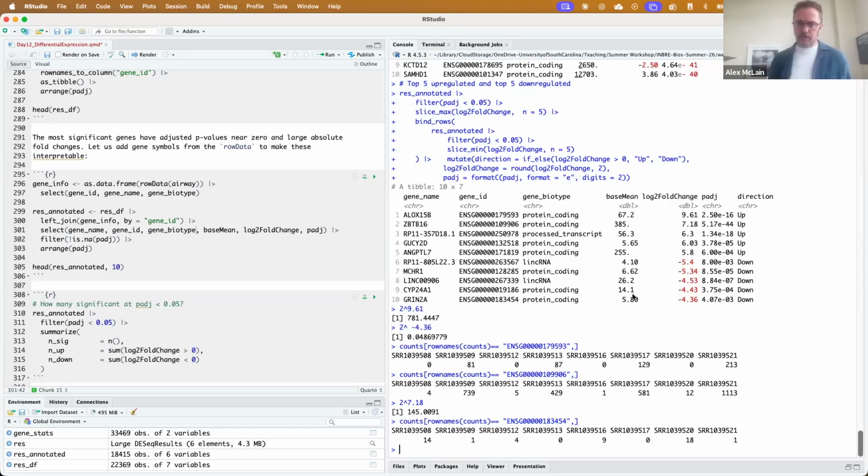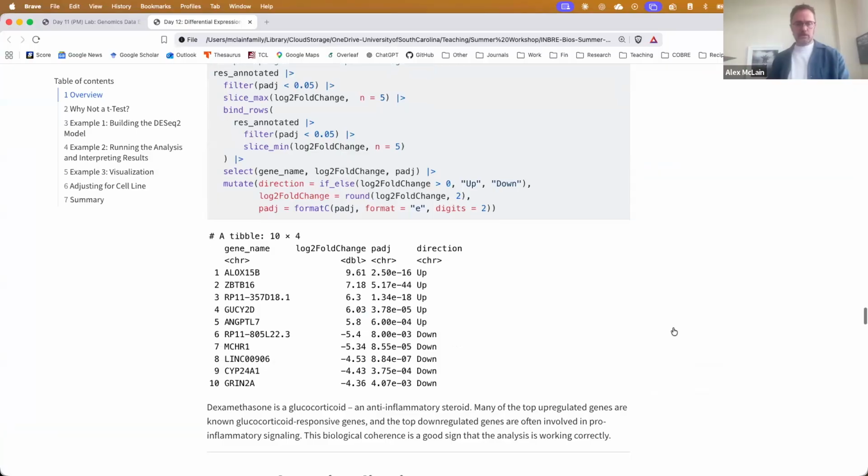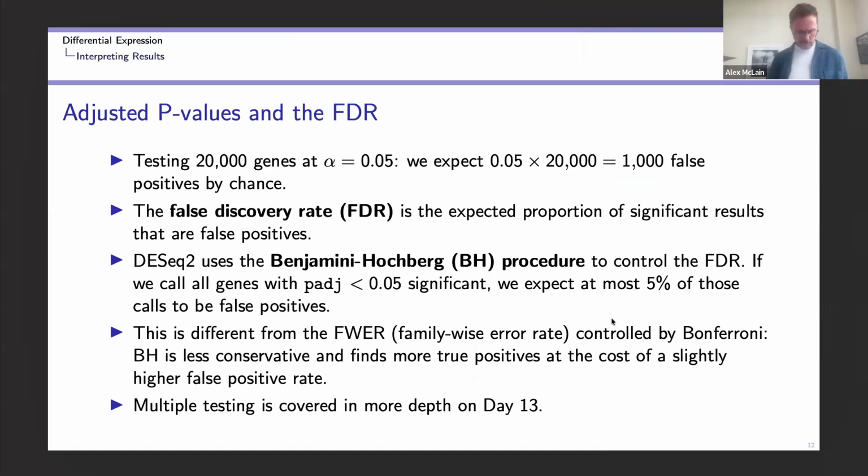So that's an indication this base mean is very low, and it's probably why the significance isn't quite as high in this situation. So an interesting way to look at this data and see what some of the important results were. Any questions on any of the results? Anything you want to look at?